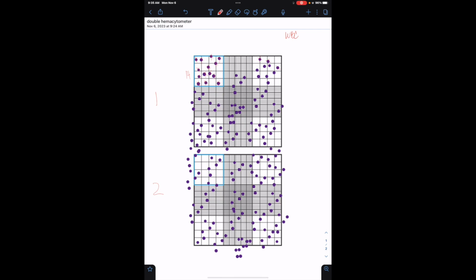1, 2, 3, 4, 5, 6, 7, 8, 9, 10. 1, 2, 3, 4, 5, 6, 7, 8, 9, 10, 11, 12. Let's see here. 1, 2, 3, 4, 5, 6, 7, 8.